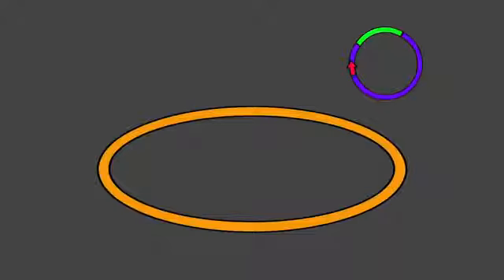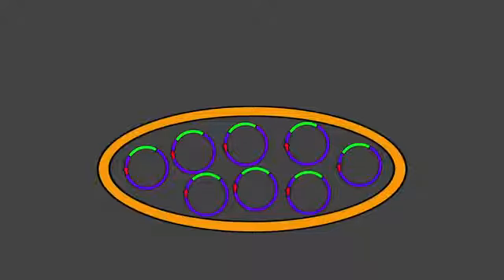To clone a gene, we get the DNA that we're interested in, amplify it, and insert it into a cloning vector, such as a plasmid. The plasmid vector contains the extra sequences needed for the gene to eventually be used in research. The resulting recombinant vector is then replicated in a bacterial cell. We then isolate the recombinant DNA, screen it for our cloned DNA, and it's ready to use.